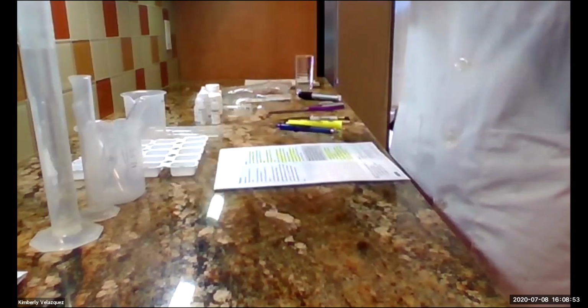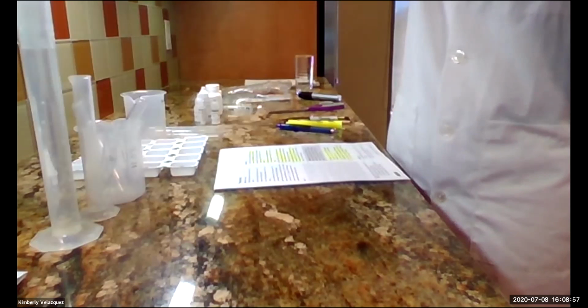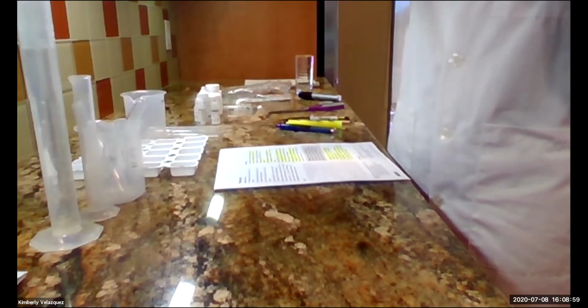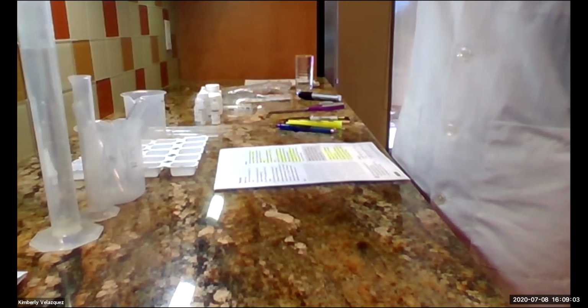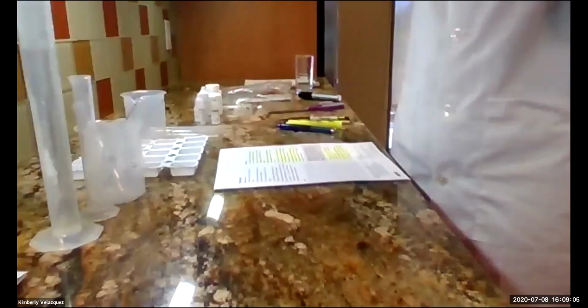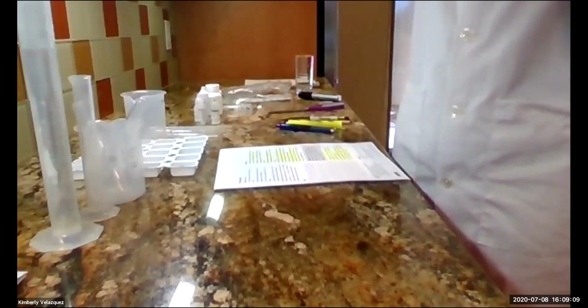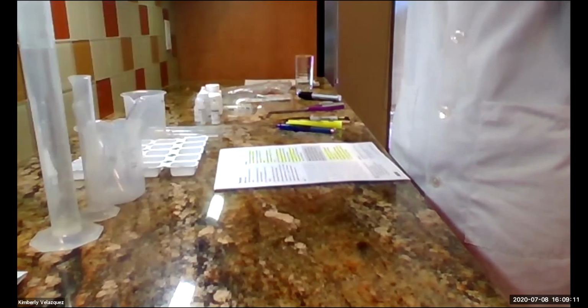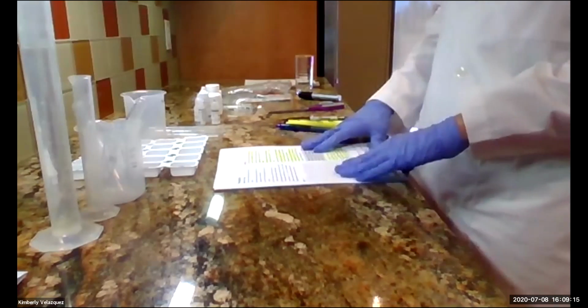First, you want to have your goggles on. So I'm going to put my goggles on right now. You can't see me, but I do have them on. And they are pretty loose when you first put them on, so make sure you tighten them so they actually do stay on your face. You just pull the tabs on the side, the elastic on the side. Okay.